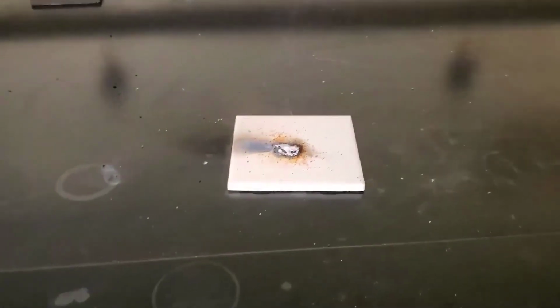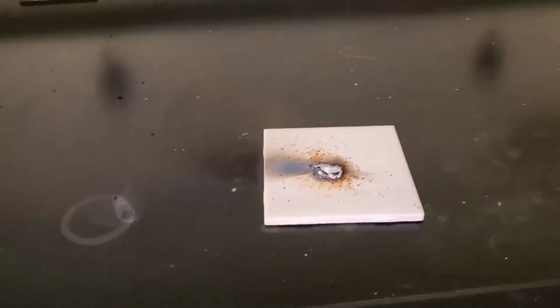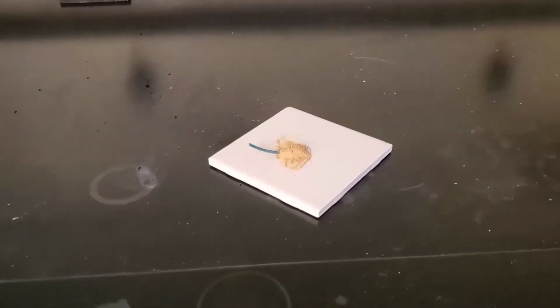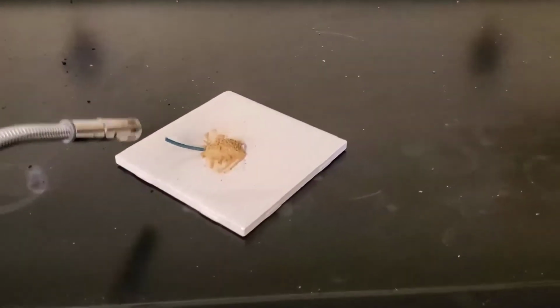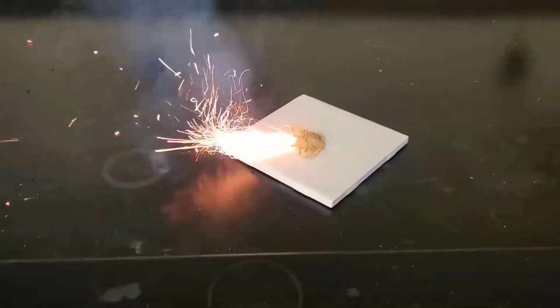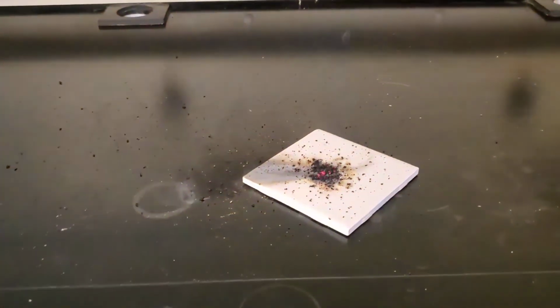Okay, pretty awesome. I don't know if that came out as red to you guys, but that's a typical mixture you would have in red fireworks. Now, because this stuff is so cool, let's do another one. Let's look for that release of energy. Whew, that one was a lot faster. So I don't know if those came out in the video very nice, but that second one was purple. The first one was really red.